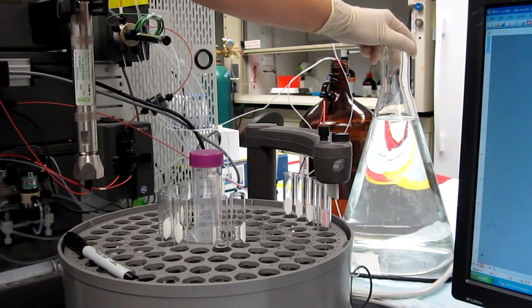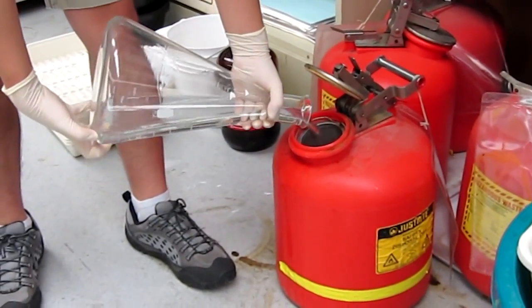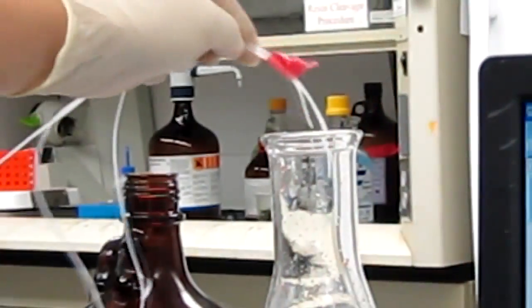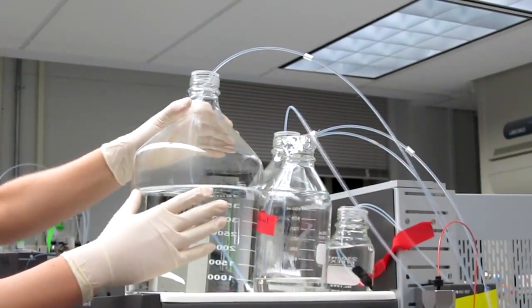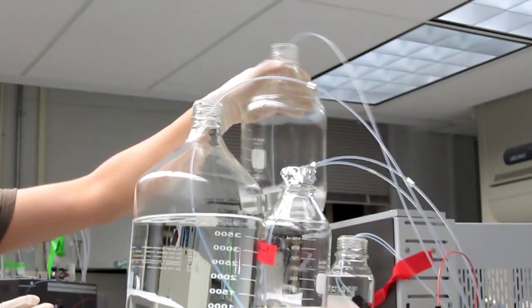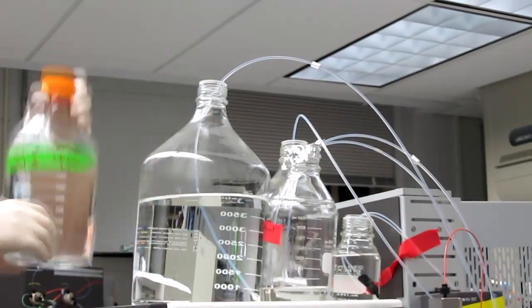First, we must make sure that everything is in order before we run our sample. Check to see that the waste is not near full. Make sure that there is enough solvent A and B for the amount of runs you need. That way, the lab can always have HPLC solvents available for use.